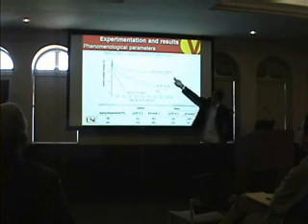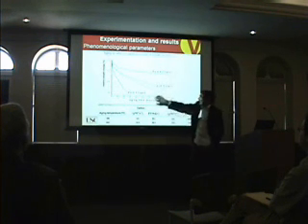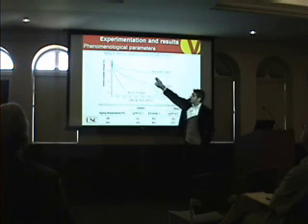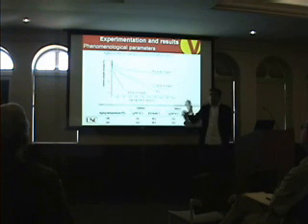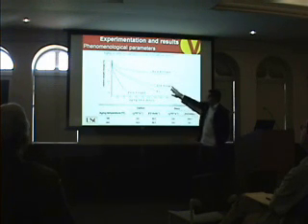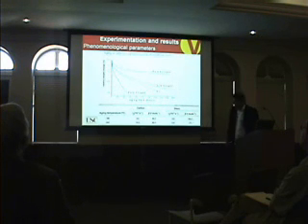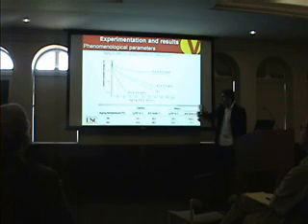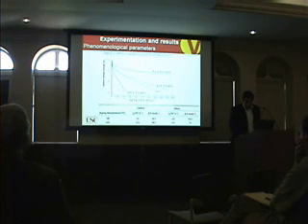The first one is for pure nitrogen, and pure nitrogen is inert. And the second one, the red one, is for pure oxygen. You see the difference of the weight loss. This difference exactly comes from the oxidation and what oxidation did to the material. And this is up to 15% of oxygen. Air is almost 20% of oxygen. By using this, we calculated the R0 and beta for the carbon section, and also R0 and beta for the glass sections.